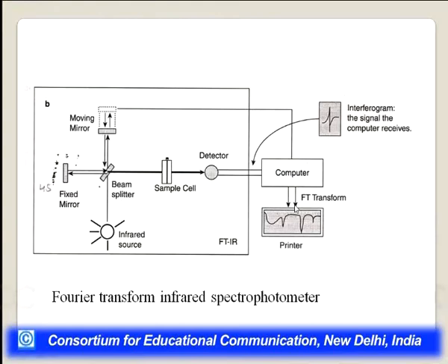So we have discussed generally what an IR spectrophotometer is and the instrumentation of the dispersive spectrophotometer. In the coming part of this lecture, we will discuss in detail the FTIR spectrophotometer and the different values which are observed by the spectrophotometer. Thank you so much.